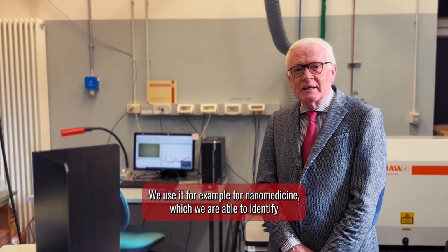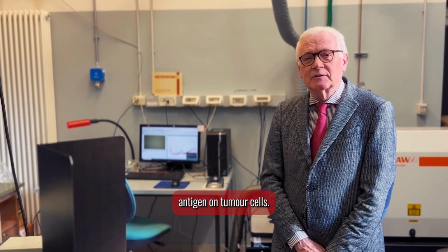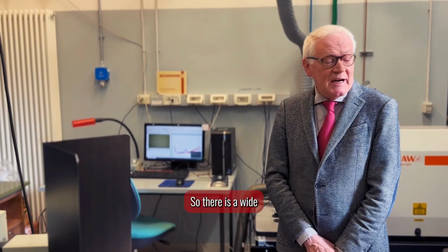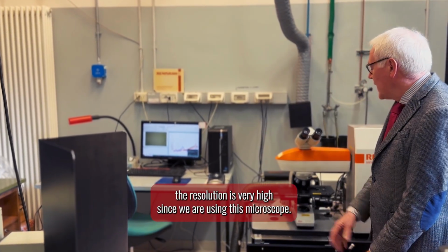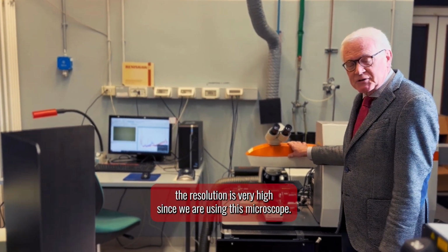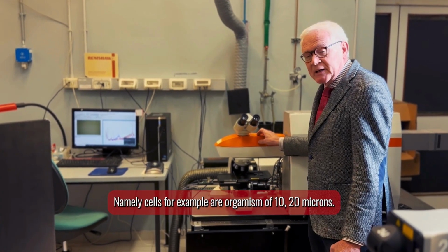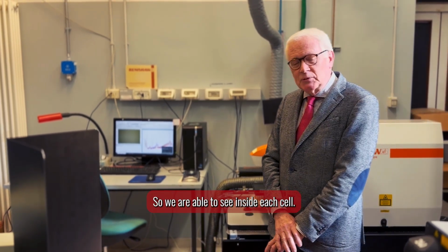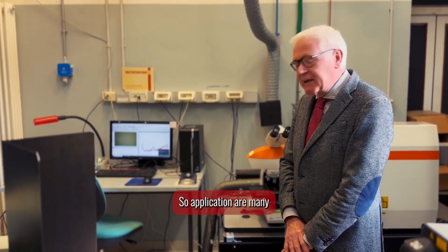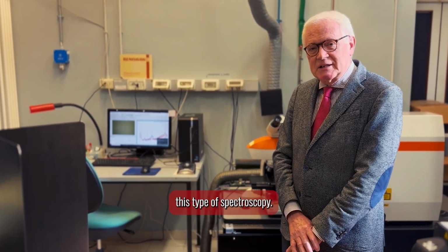We use it, for example, for nanomedicine, in which we are able to identify antigens on tumor cells. So there are wide possibilities of using this Raman spectroscopy, because also the resolution is very high since we are using this microscope, and so the resolution can be down to the order of 1 micron. Namely, cells, for example, have a dimension of 10, 20 microns, so we are able to see inside each cell. So applications are many, and we think that we will develop this type of spectroscopy further in the future.